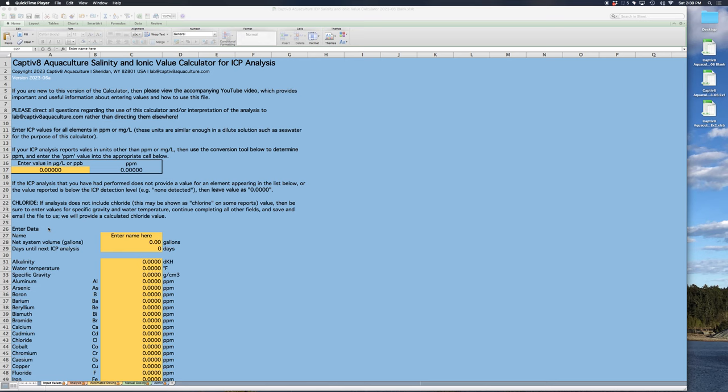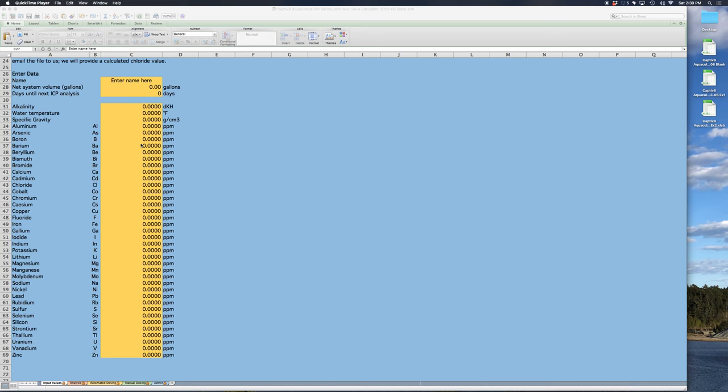And again, it must be emailed to you. The reason for that is just because our web platform does not play nicely with binary format Excel files. It's not possible for us to put it up there to download. So when you open up the file that's been emailed to you, this is what it's going to look like. All the values are going to be zeros.